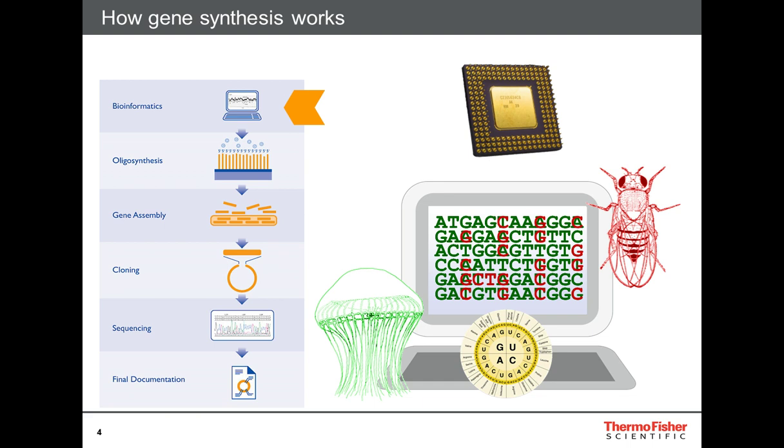And this is where we can do an adaptation in the computer and modify, in these cases here, the wobble bases marked in red to match the most frequently used codons in the fruit fly. So this is all in silico. Now we have an electronic sequence in the computer, and the next task is, of course, to turn this into a tangible molecule.